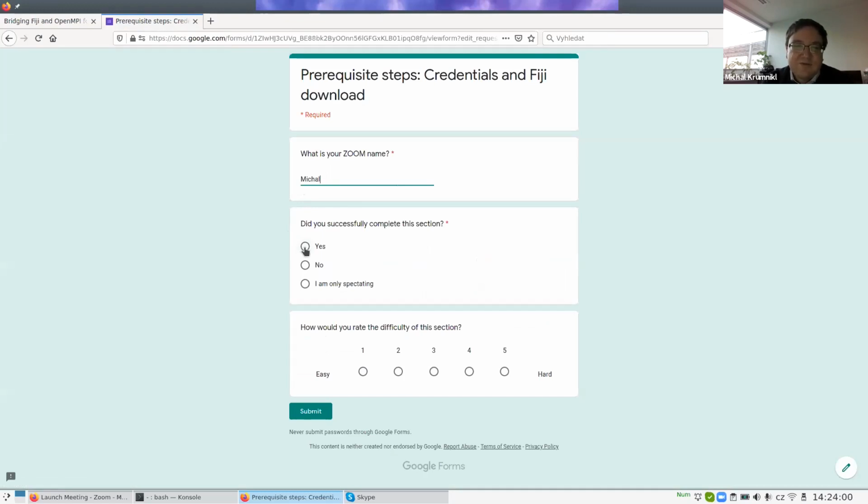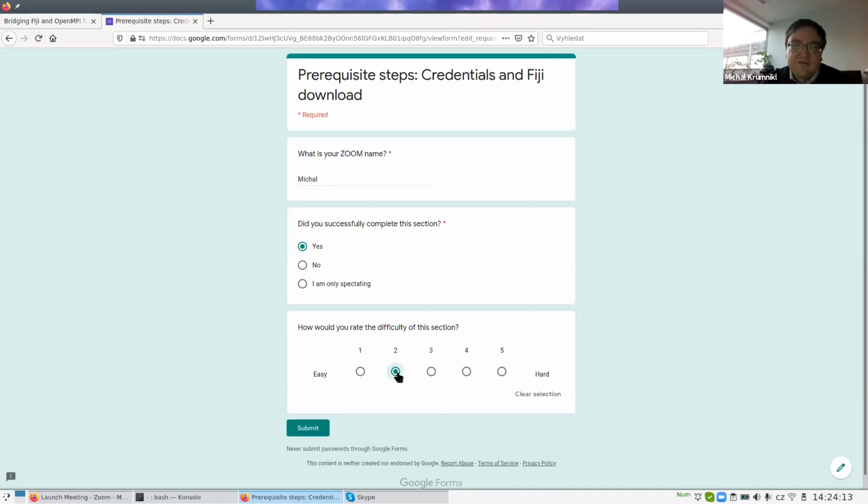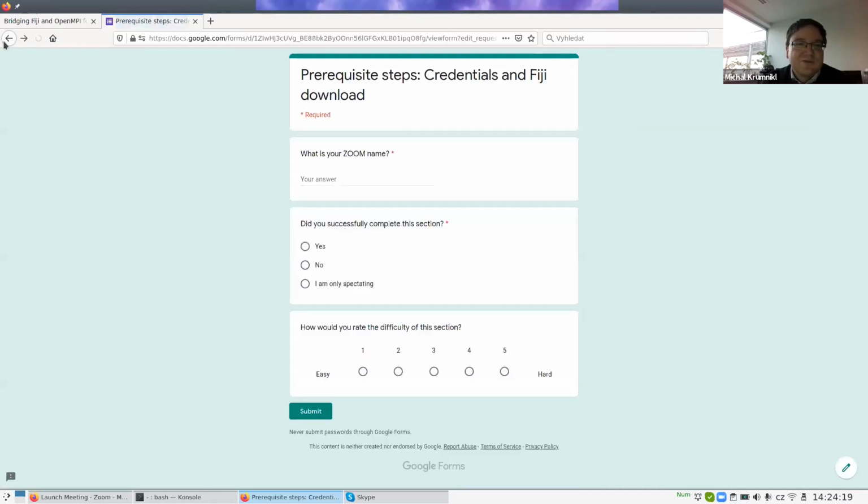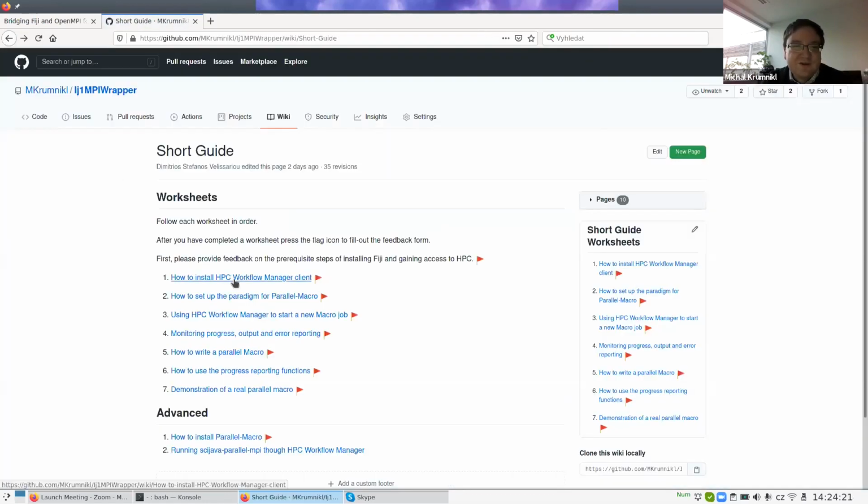I will have a look at it during the time, so if you have problems, we will notice it. We will stop and try to fix it. Also just indicate if it was easy for you, so you already know it, or if it was hard. So I'll just select 2 and submit it. This is the job that you should do after finishing each of the steps of the presentation.